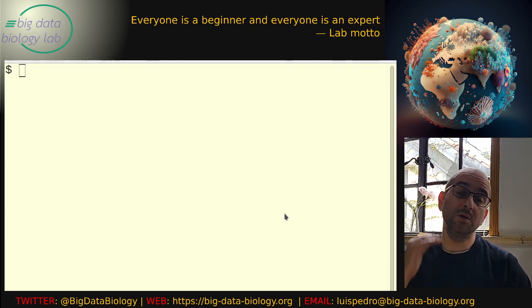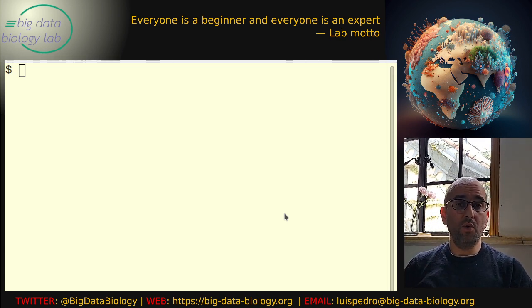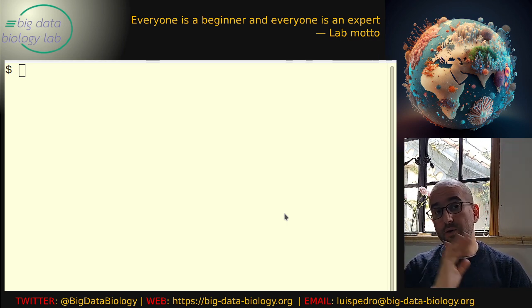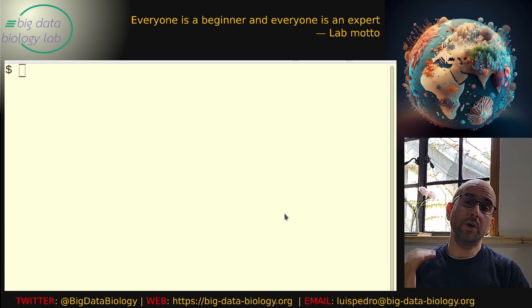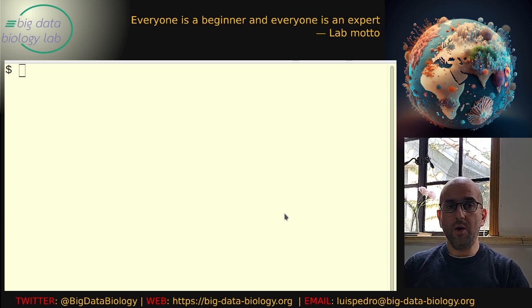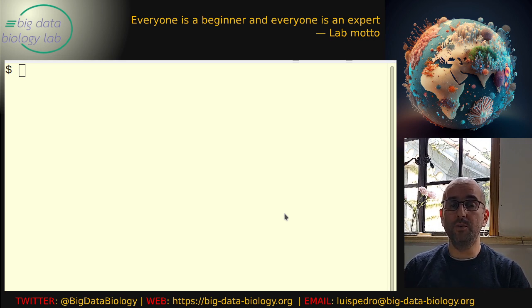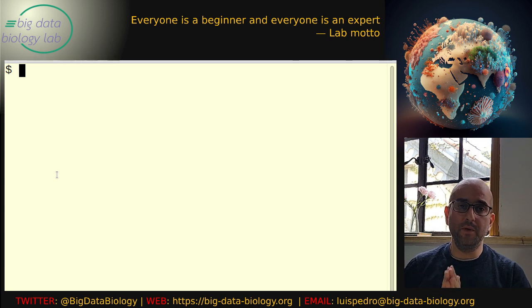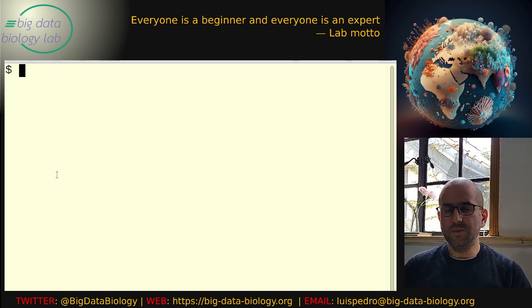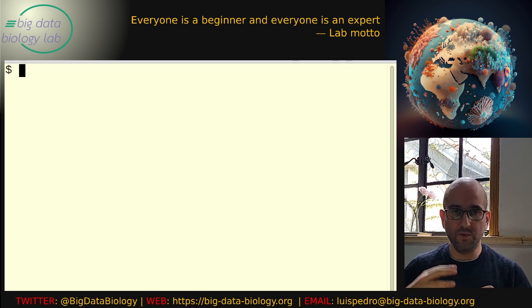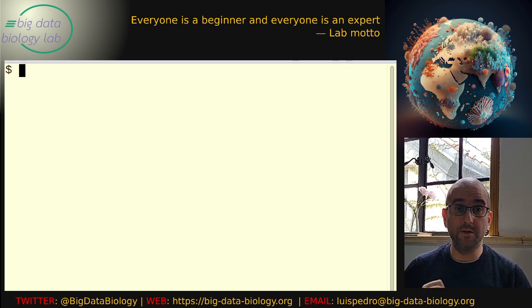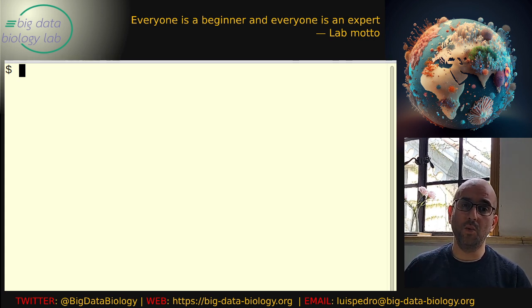Hello, welcome back. This video is a little bit of a follow-up to the previous video, although you can also look at them independently and just watch this one. I want to show you how you can get annotations for a sub-catalog of the GMGC — the Global Microbial Gene Catalog. The important thing to understand is that the GMGC has many concepts that interlink, and you get a lot of power out of it if you start to understand the interlinkages and how the identifiers work. This can be a little bit daunting at the beginning, which is why we do these videos.